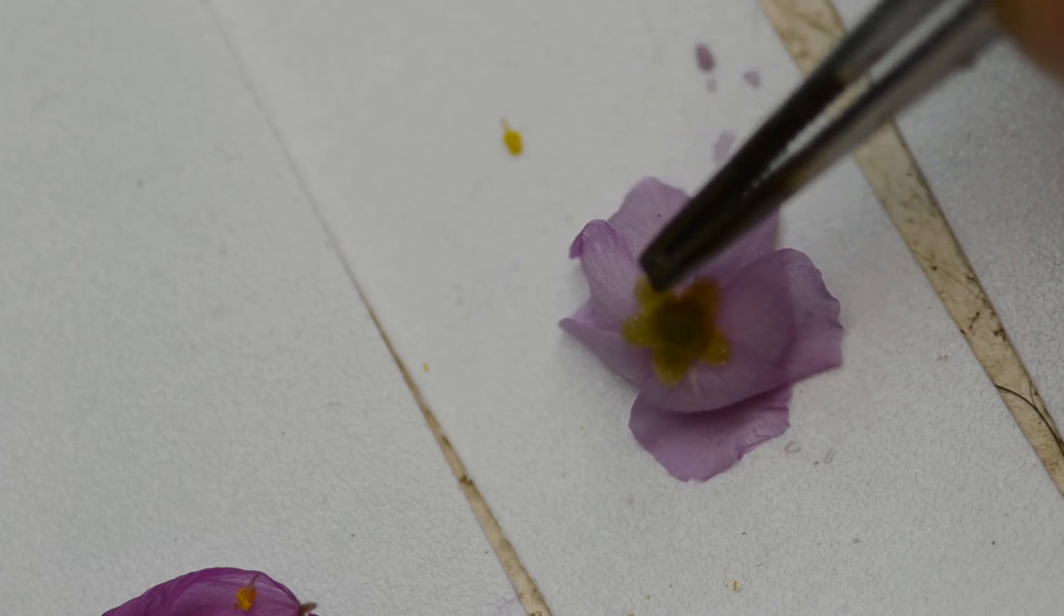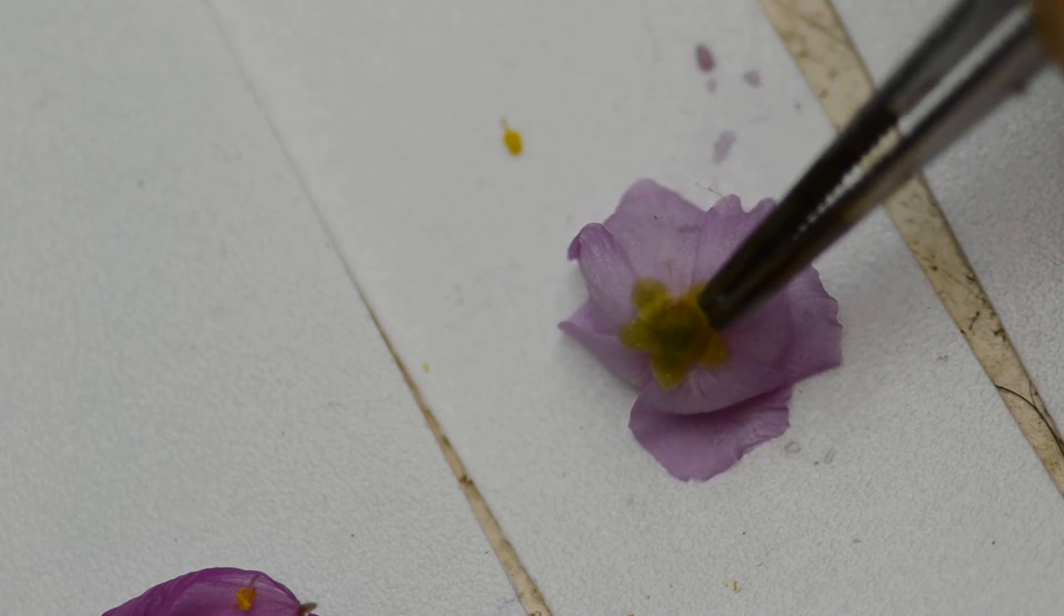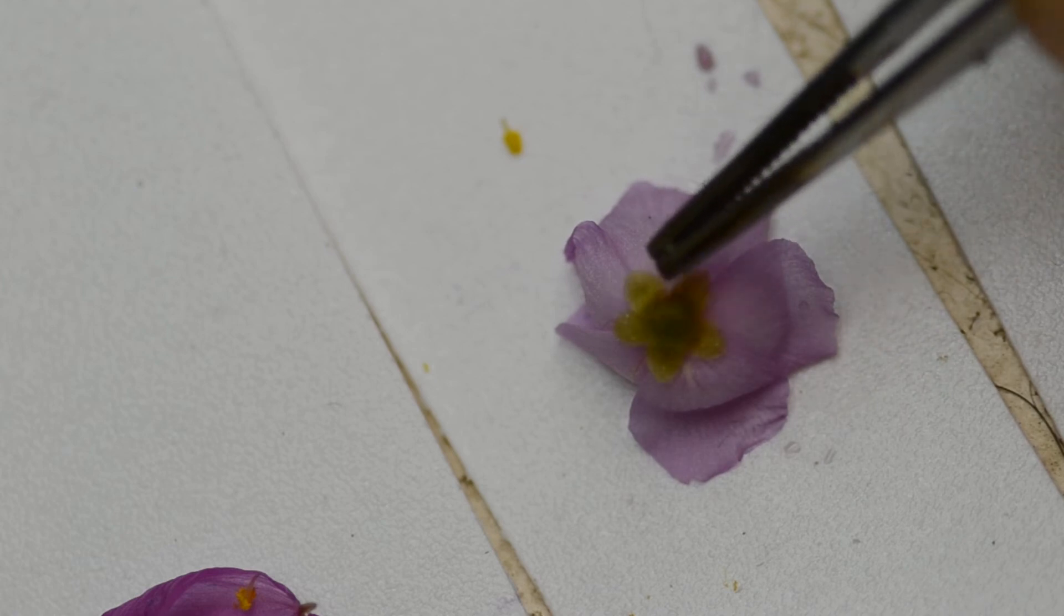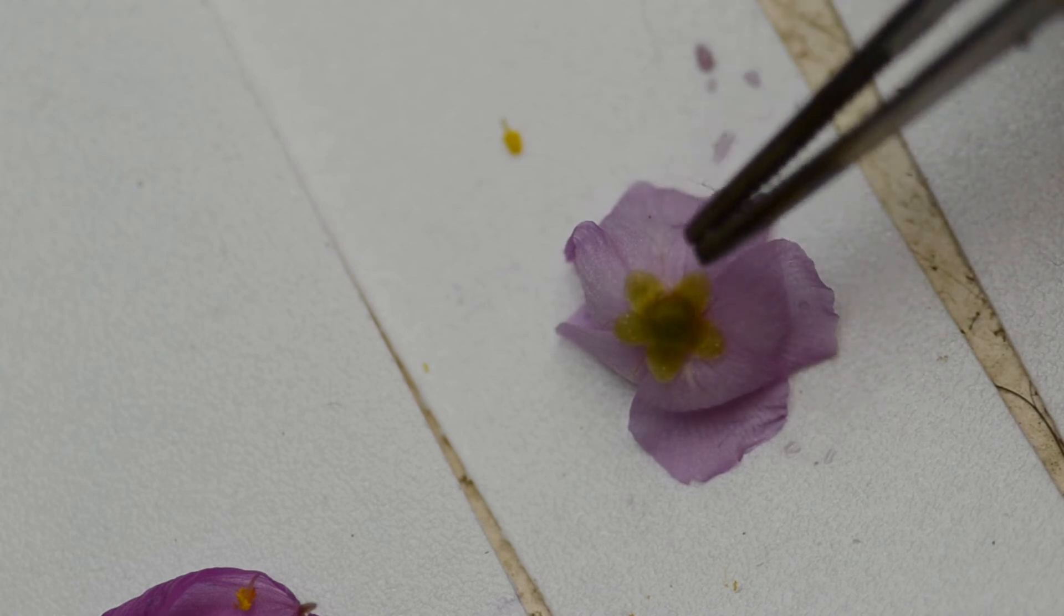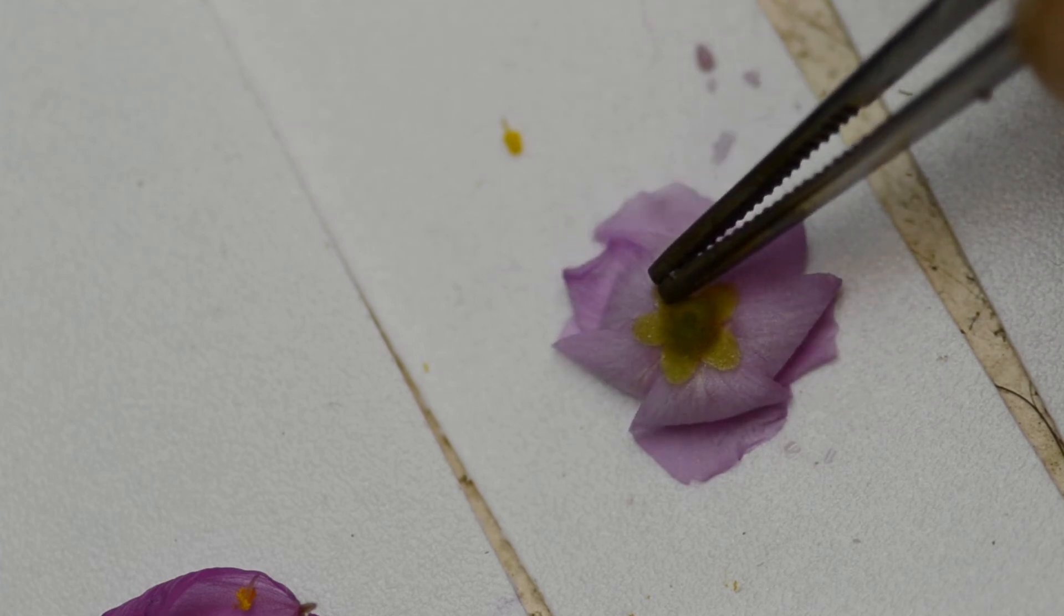And then on this bottom part of the flower, there's this lump. And that lump is the connection to the flower stalk, which is known as the peduncle, I believe. Kind of an odd name.